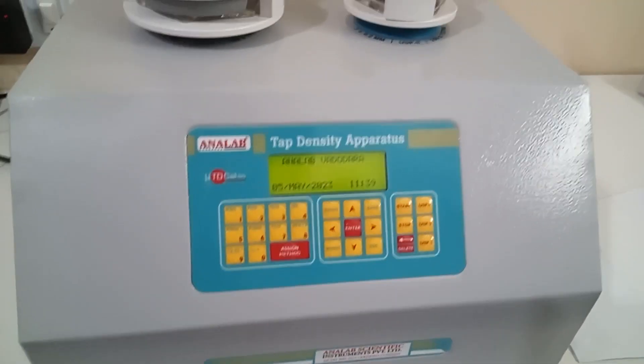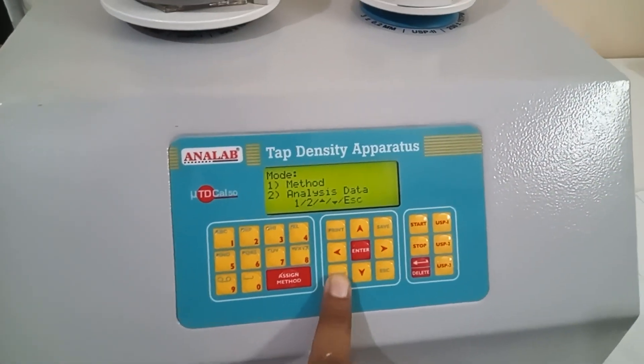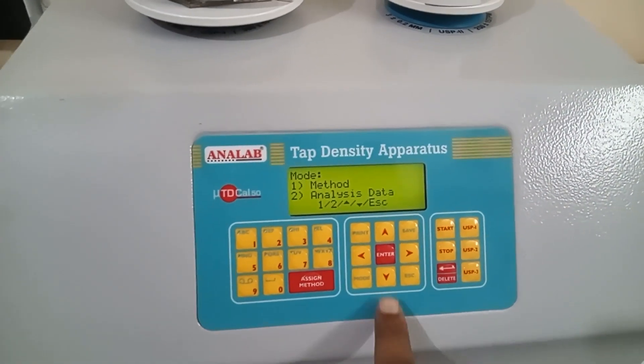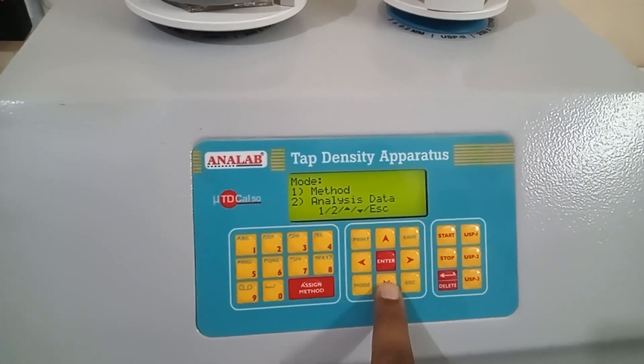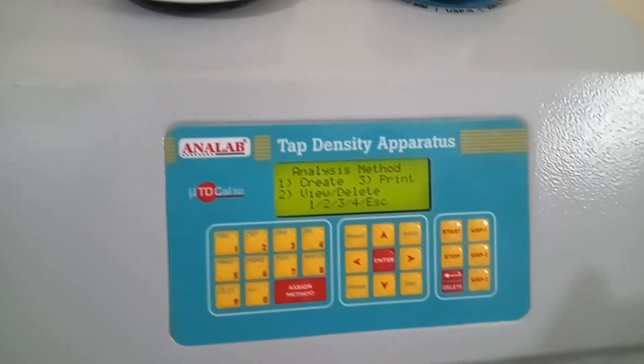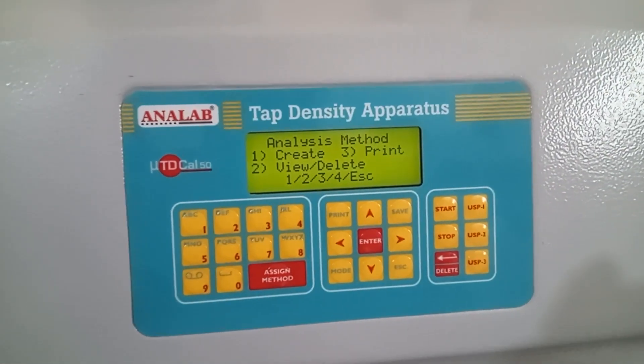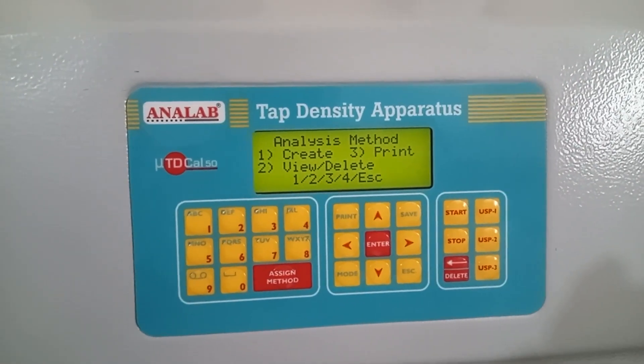So let's first start with the mode button to see the options available. There are 4 different things. First of them is method. Method will be used to create, print, view, or delete the methods — these are basically the different types of analysis methods which will be used.